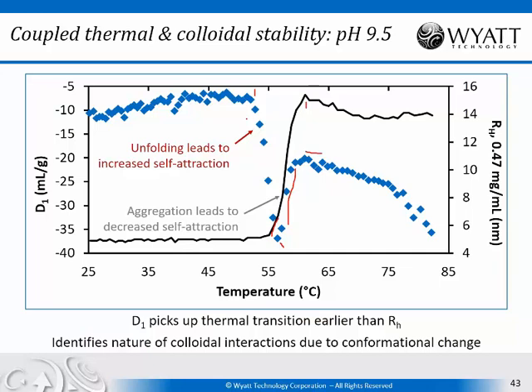So the temperature is causing some conformational change, which is not a significant change in size. It's perhaps just beginning to reveal a hotspot for aggregation without true unfolding. And that hotspot is leading to colloidal interaction between the molecules in solution. As the temperature increases, that hotspot is exposed more and more, still not undergoing major significant unfolding, until it reaches some significant threshold value here, where the hotspot is now fully exposed.